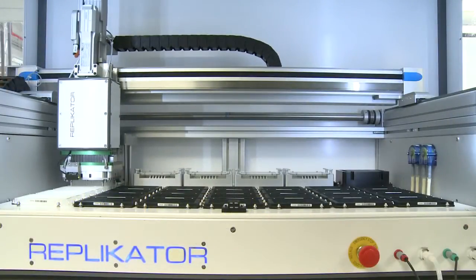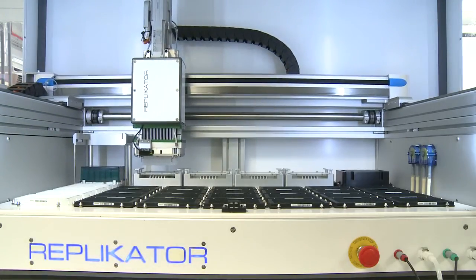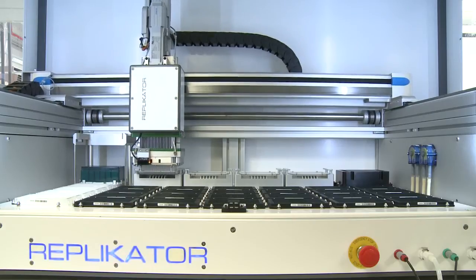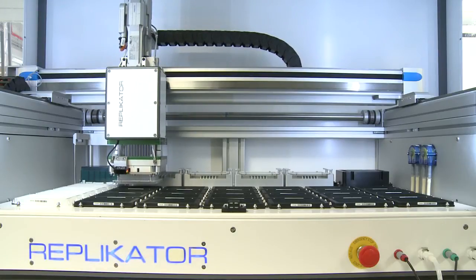The robotic system is able to array in ultra high density 1536 plates accurately and repeatedly at 1.5 microliters, but can array 96 or 384 well plates equally as well. You can replicate in any format of plate by changing the tip head, giving you a massively flexible platform that reduces hands-on time and error.